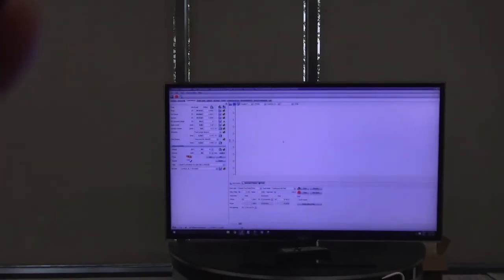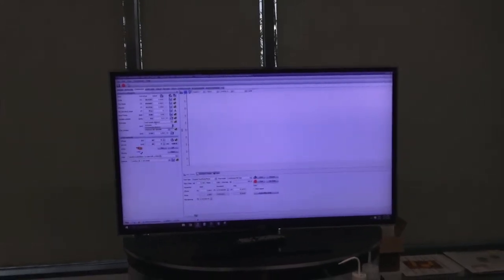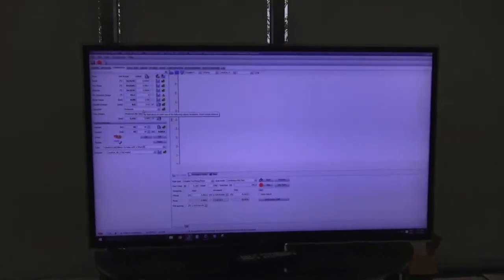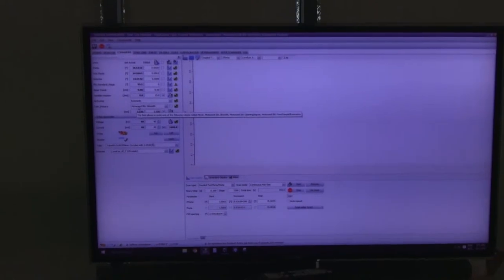Okay, so right now the last scan that we did was a traditional Bragg-Brentano geometry fixed slit scan. So what we'll do now is set up just real quick a DBO scan. We'll set our air scatter screen, that's our mass, to automatic. So I don't have to tell it like 5 millimeters or physically put it somewhere? Nope. Based on the size of your divergence slit and the 2 theta angle that you're measuring, the height of that air scatter screen will automatically move to where it needs to be so it doesn't crop the beam.